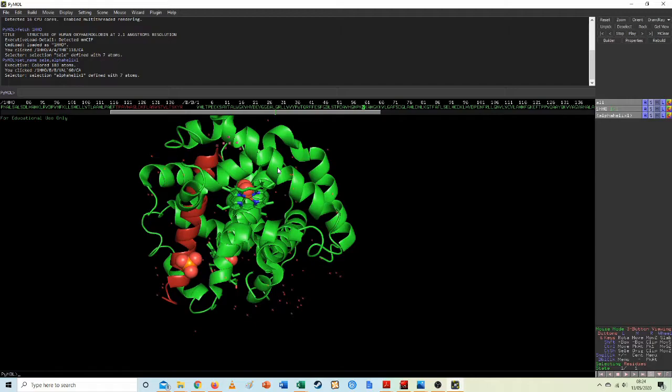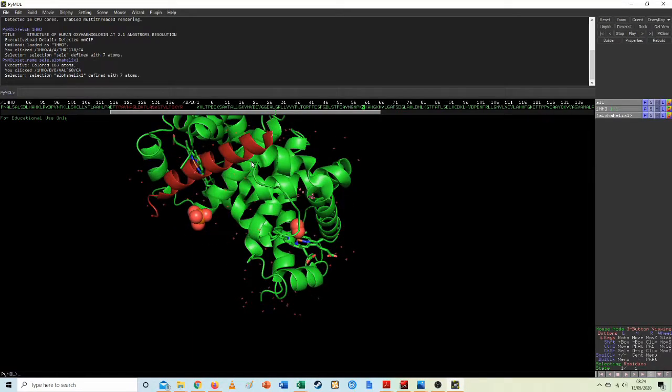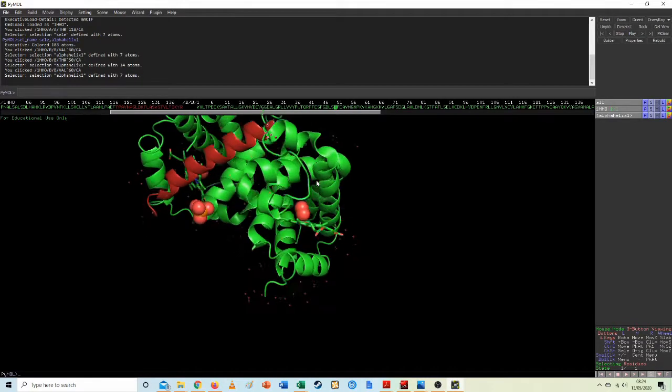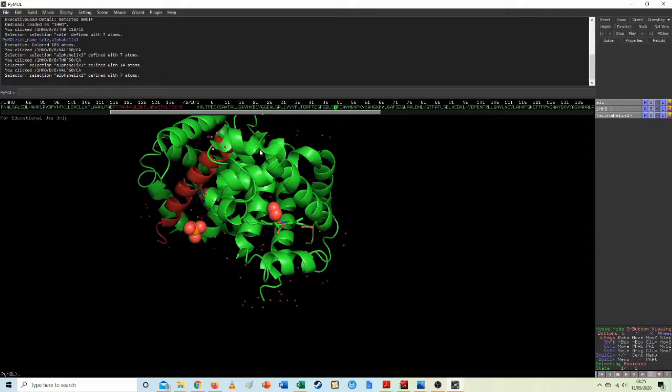I'm going to pull out a little bit from this. And, ooh, no. Look, that one goes right the way here. Right, and I want to, yeah, deselect that. Right. Okay, now this alpha helix is really interesting because we've got a really weird kink in the alpha helix. PyMOL's considering this pretty much all an alpha helix. This bit's really contorted, so it might be interesting to see what that looks like.